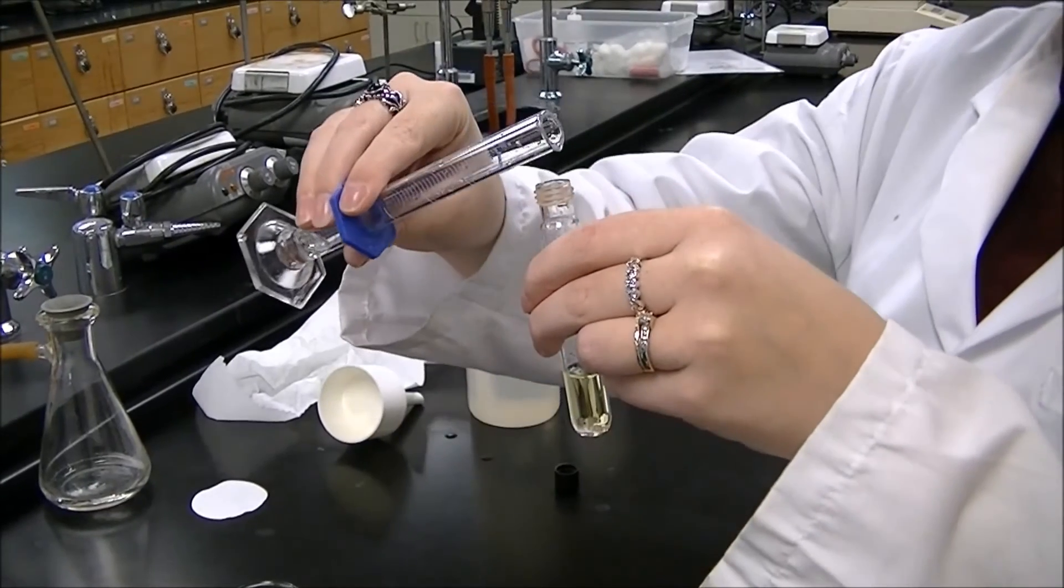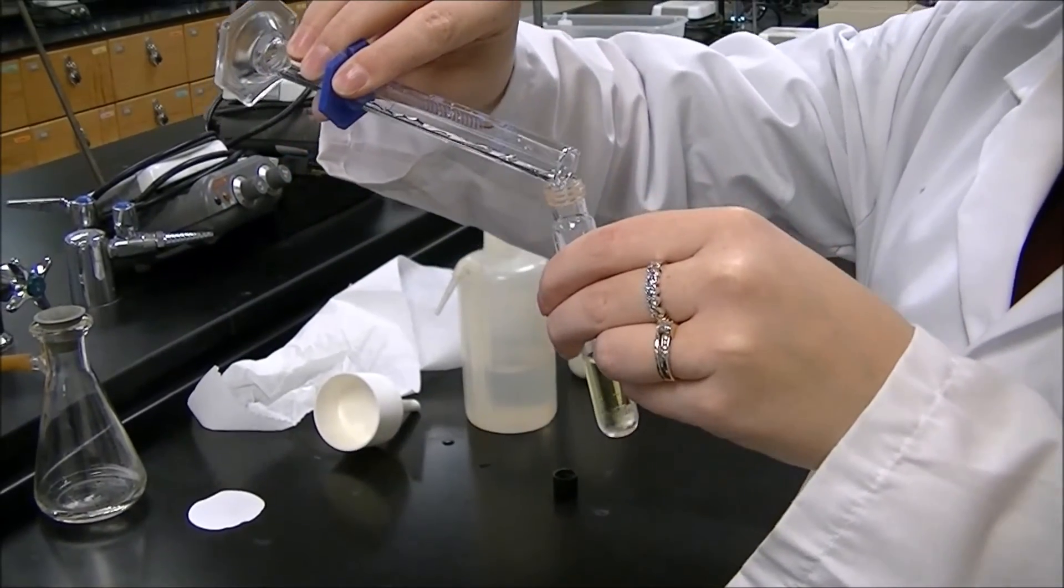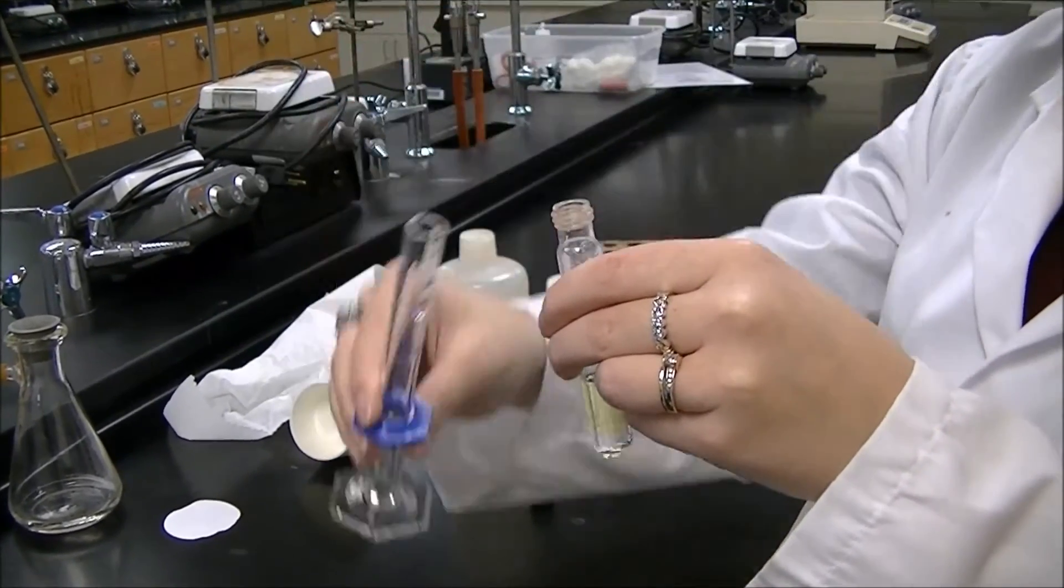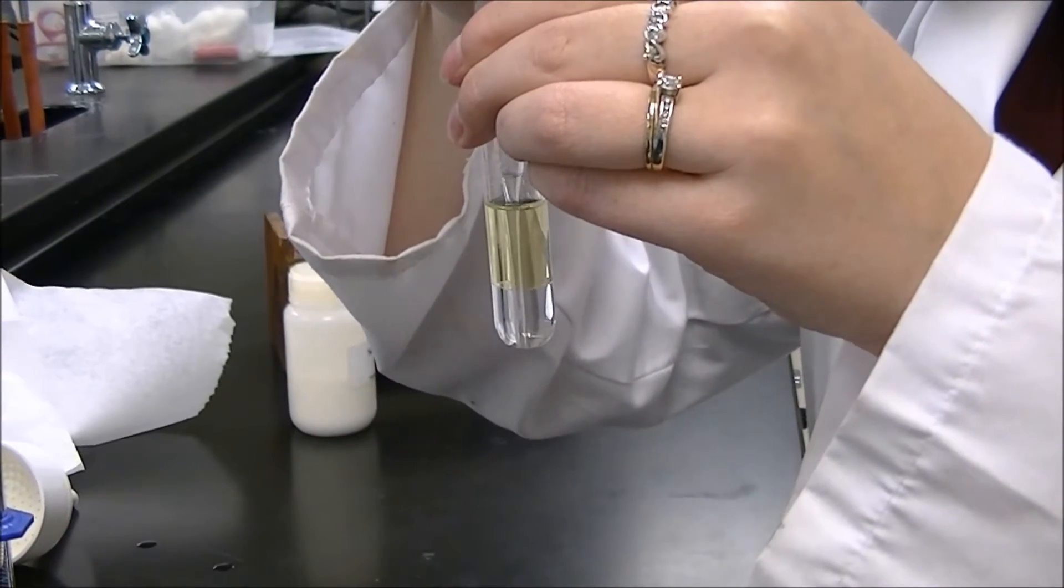To the organic layer left over in the centrifuge tube, we're going to add two portions of 1 milliliter of water. After washing, you'll remove the bottom aqueous layer for disposal.